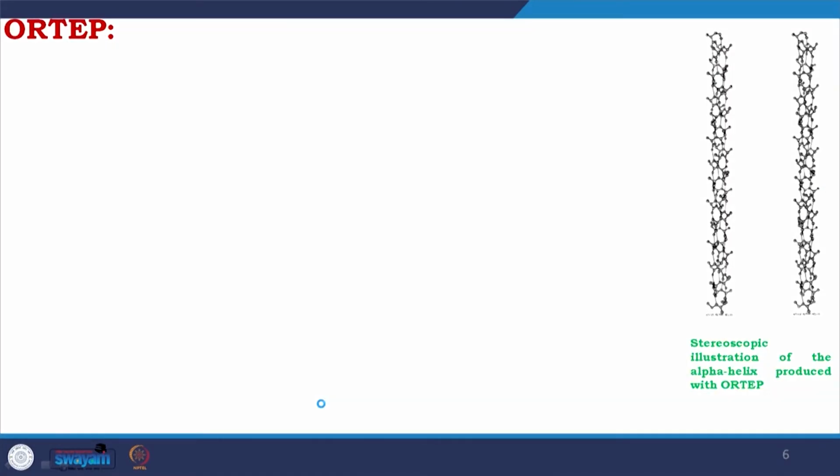We will try to have a look in brief at those. ORTEP we have already talked about.